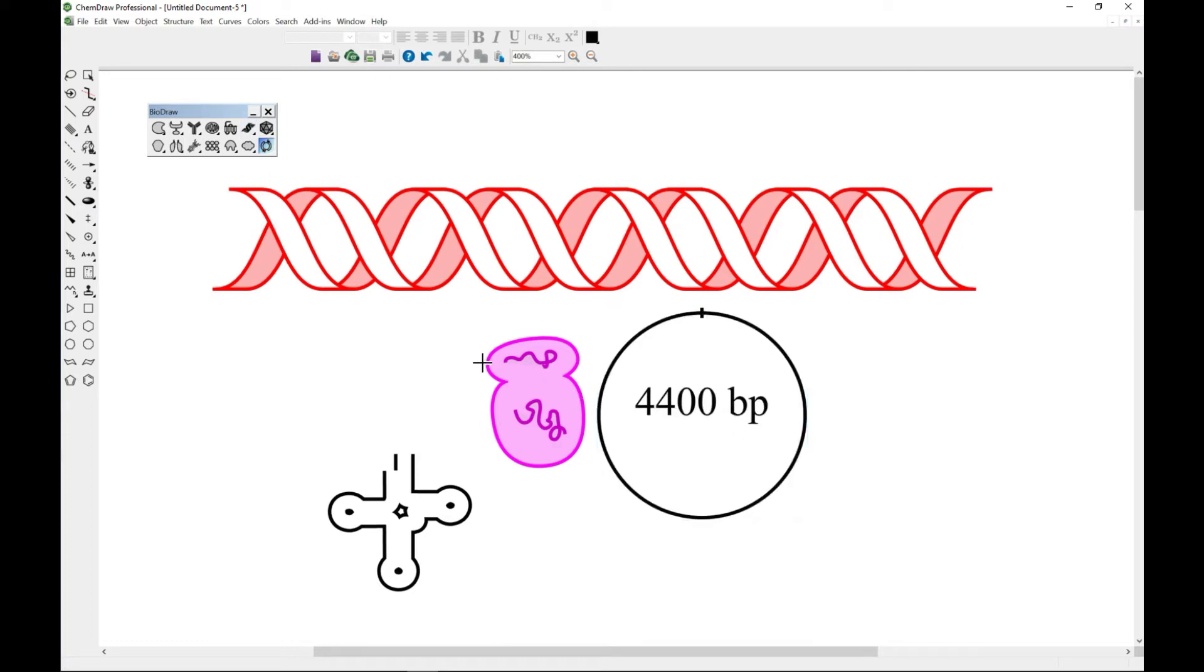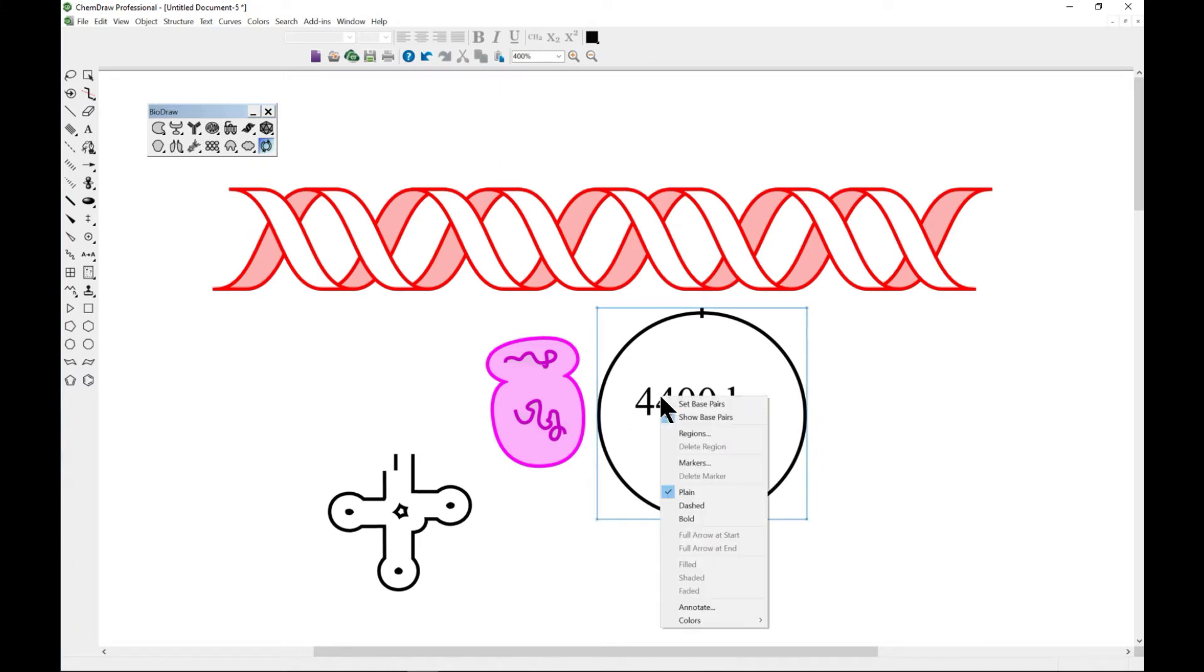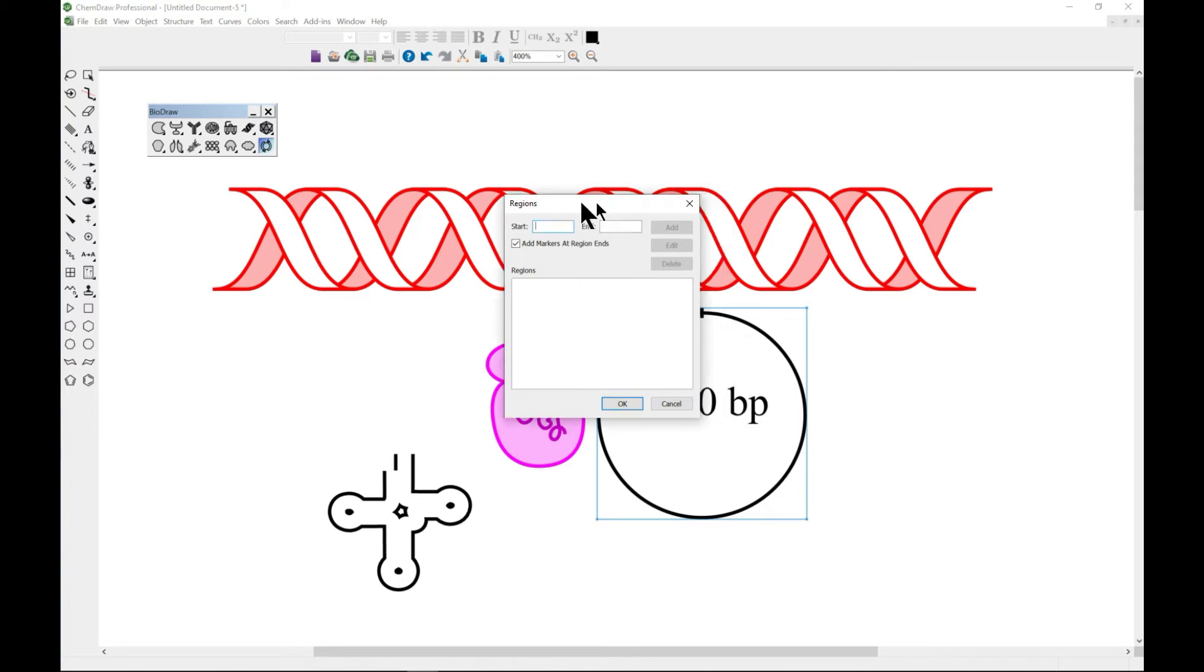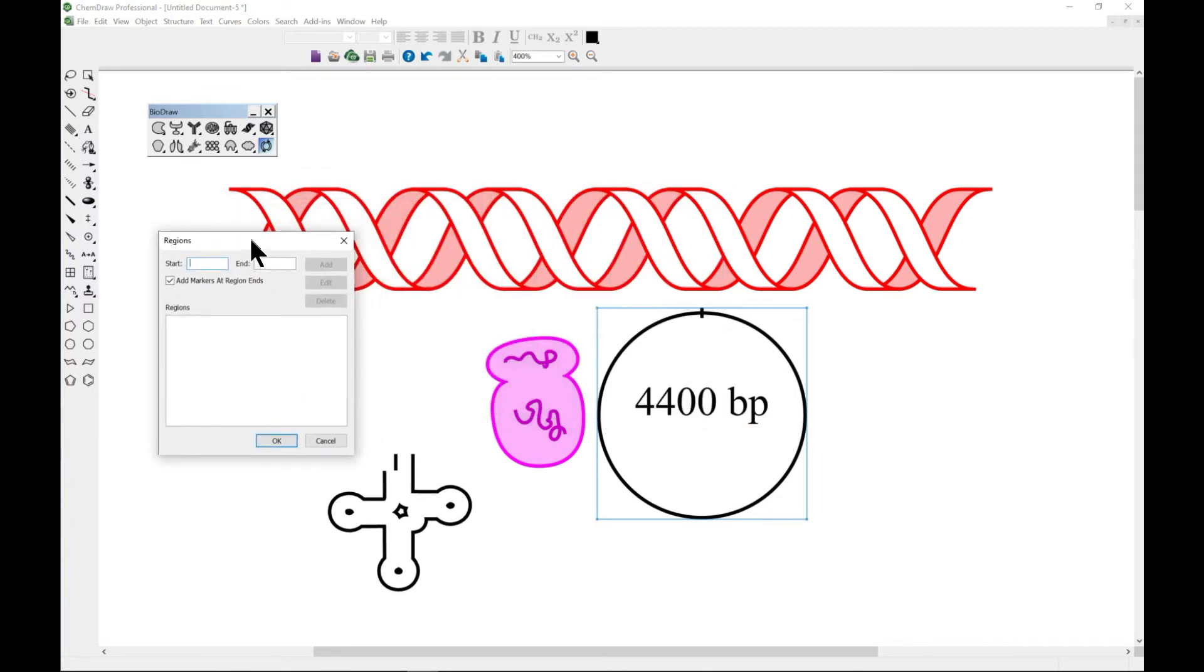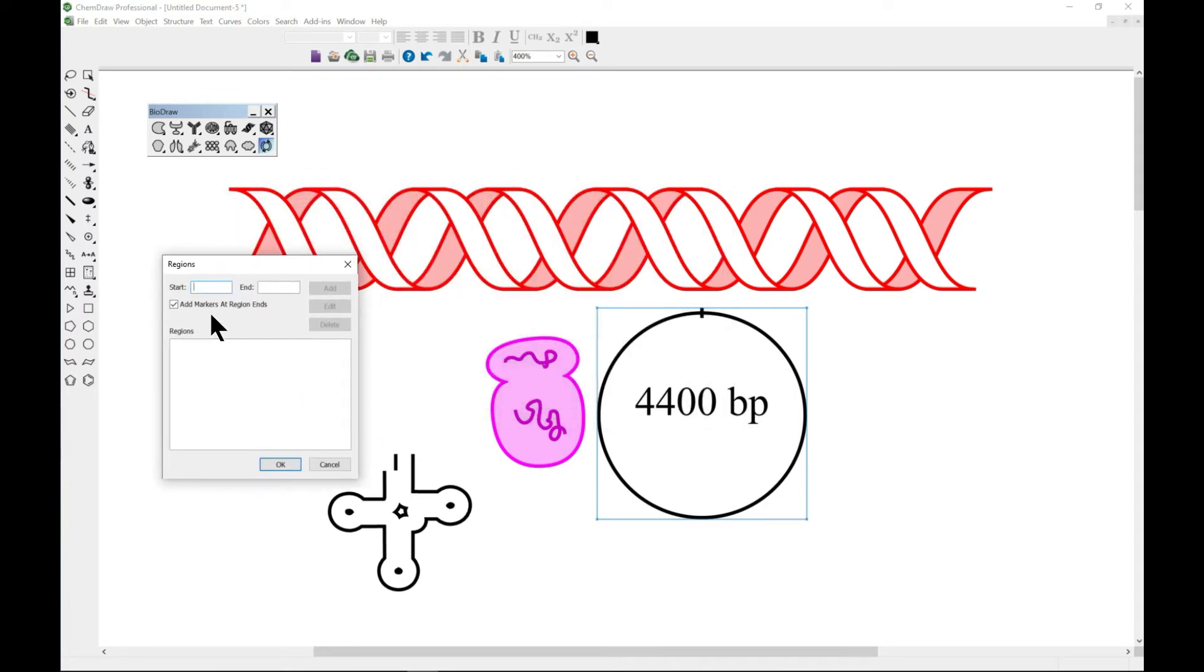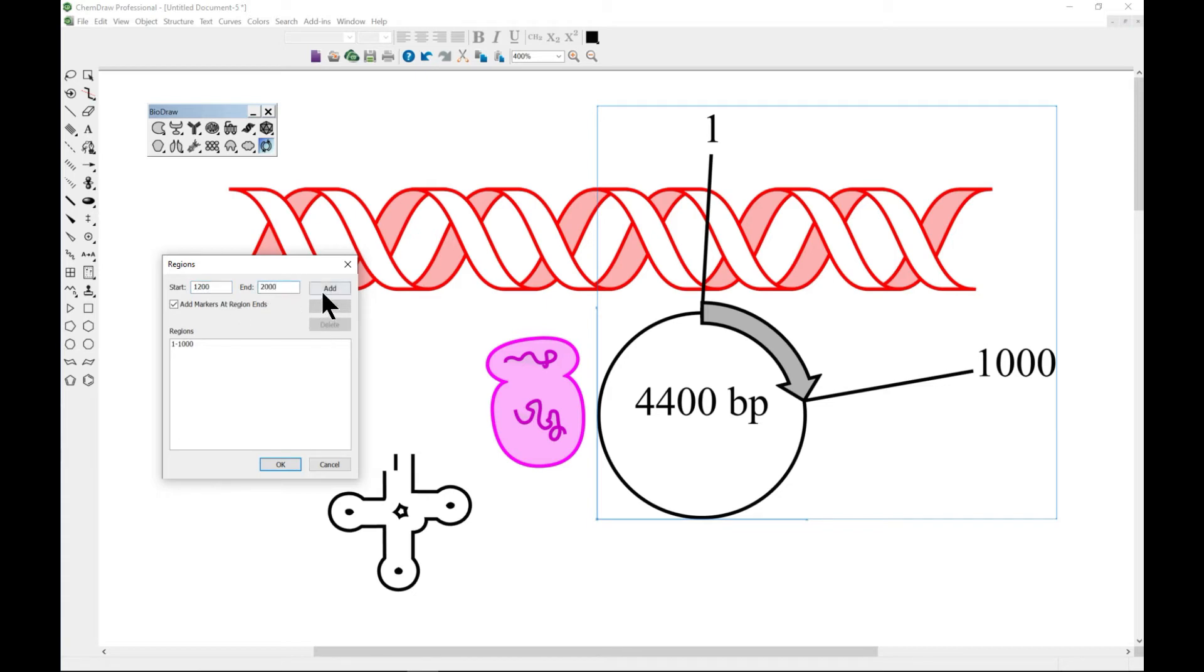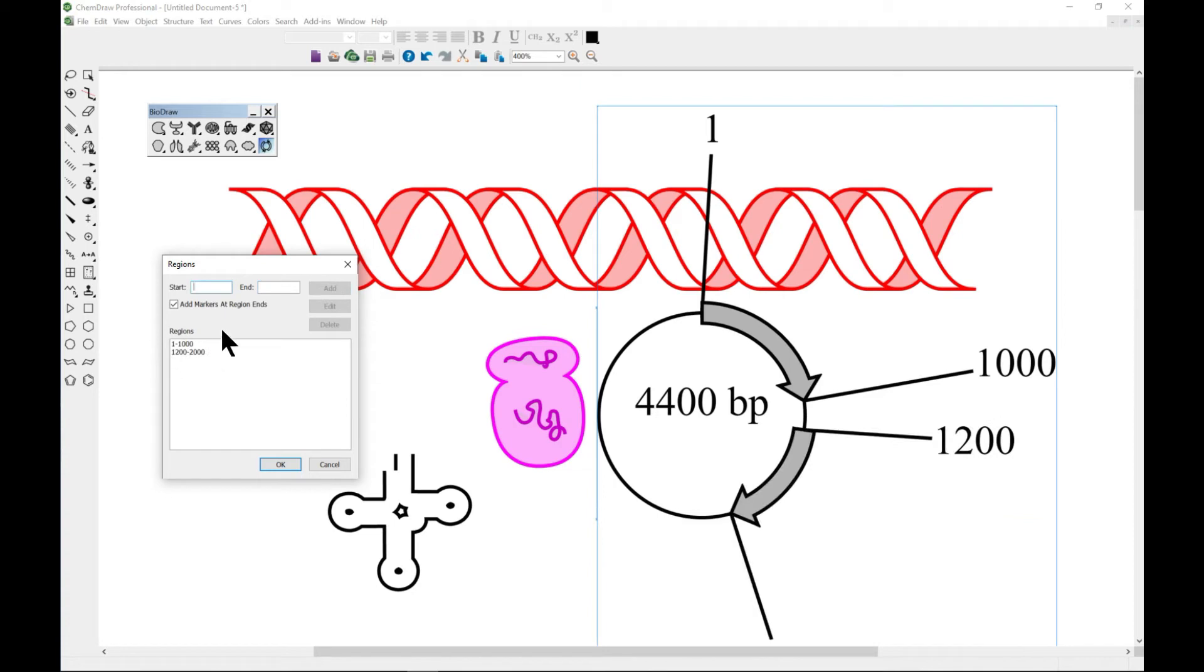Once you have your plasmid map, you can right click and go to regions and you can set your region. Let's say we have one to, let's make it a thousand, and do add and you have this. You have the region set. You can do 1200 to maybe 2000 and go to add.